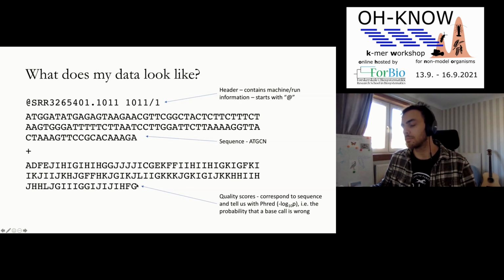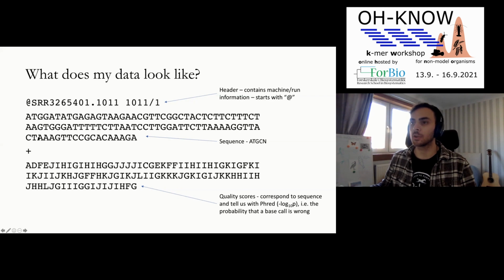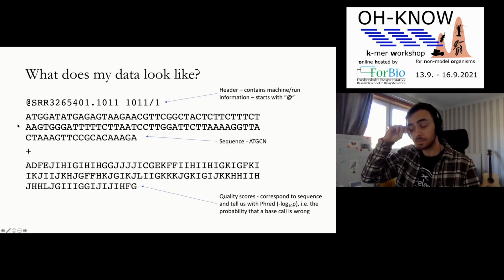Phred scores are also a bit of an enigma in the sense that they don't always make sense to compare across runs, but they can be very useful within a sequencing run to figure out if you have some badly sequenced strands. And this is obviously one read. So in your Fastq file, you will end up with many millions of these probably. And as you have seen, each of these is basically 4 lines. So it's a bit compressed here, but in reality, you have the header line, the sequence line, the plus, and then the quality line. So that's just worth bearing in mind when you're trying to figure out how much data you have and things like that.